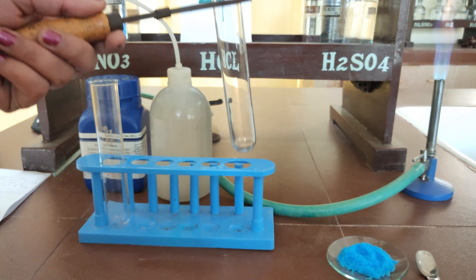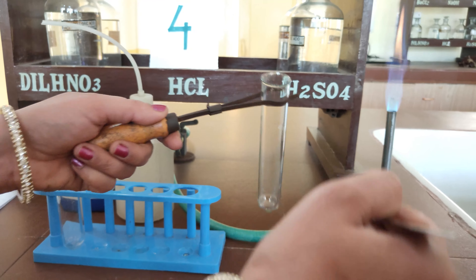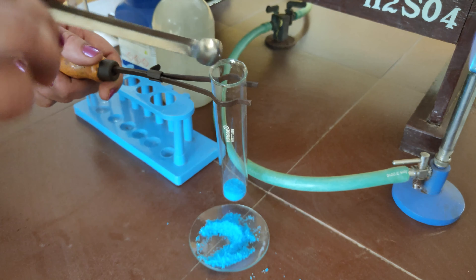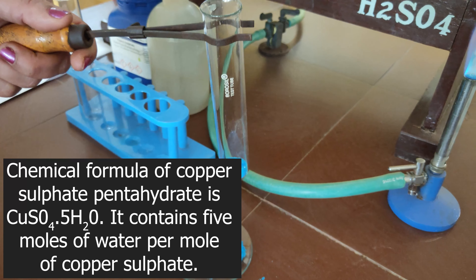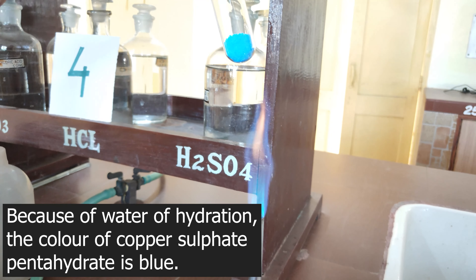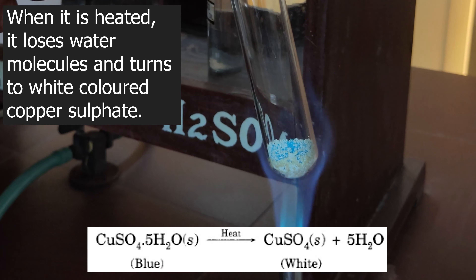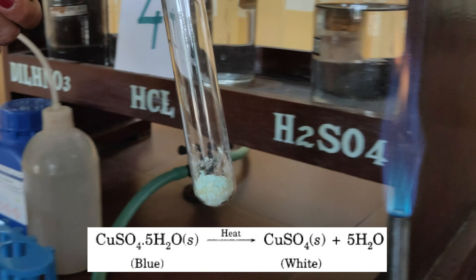Procedure: Hold the boiling tube with a test tube holder. Using a spatula, take a small quantity of copper sulphate crystals and put them into the boiling tube. Heat the boiling tube over the flame of the burner, first gently and then strongly. On heating, copper sulphate crystals change colour from blue to white. Hydrated copper sulphate contains water of crystallization; on heating, CuSO₄ crystals lose their water molecules and form white coloured anhydrous copper sulphate.